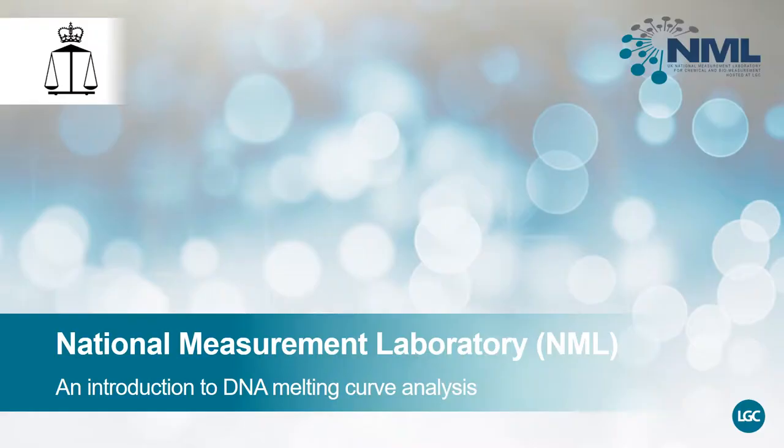assay design. However, if you require additional information, please refer to the 2013 LGC publication, Good Practice Guide for the Application of Quantitative PCR by Nolan, Huggett and Sanchez, which is free to download at www.lgcgroup.com/NML.